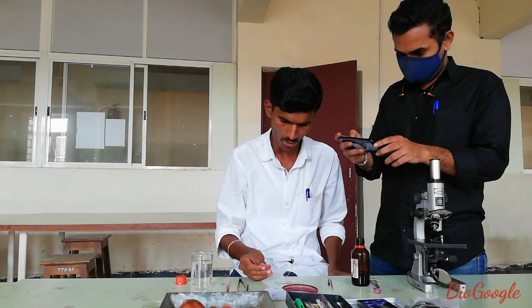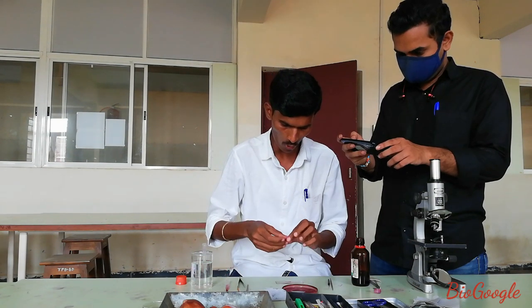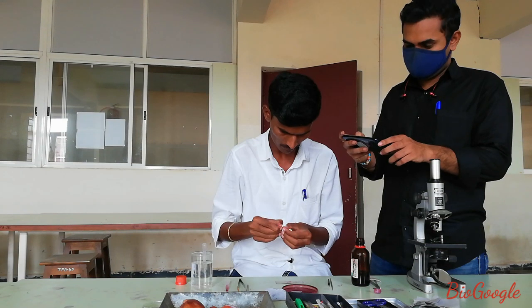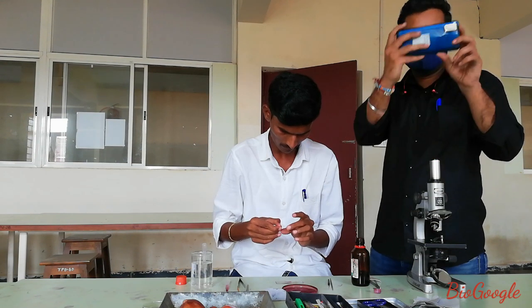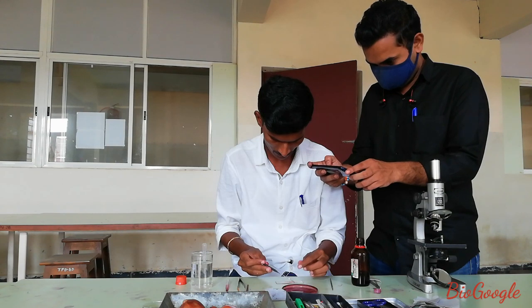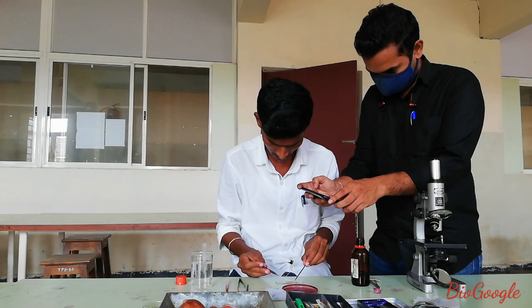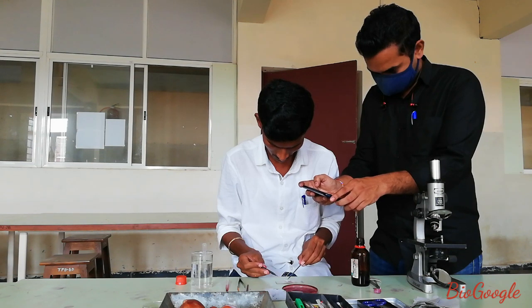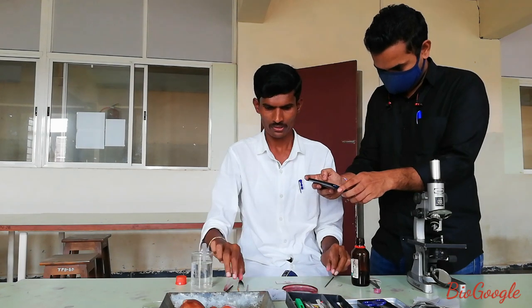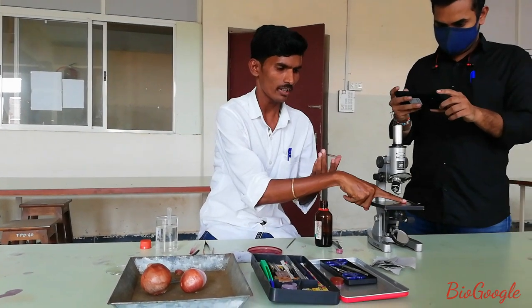Add one drop of water on the peel and then place the cover slip with the help of a needle. We have now prepared the temporary mounting of onion peel, which is then observed under the compound microscope.